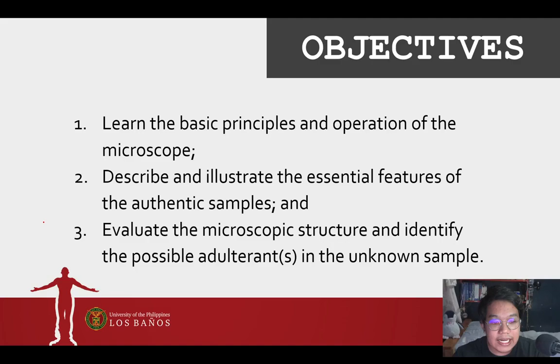So, basically, in this exercise, you will be provided with a specimen and you'll have a glimpse of the features of the specimen, which is your unknown. And then you have to identify the identity of your unknown based on the standards that we will be providing to you.